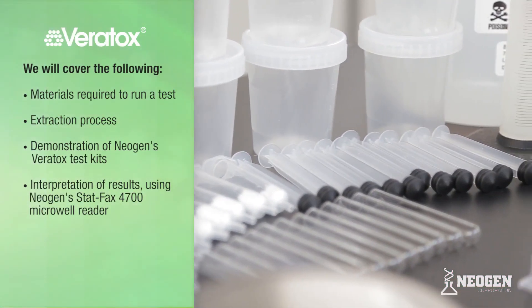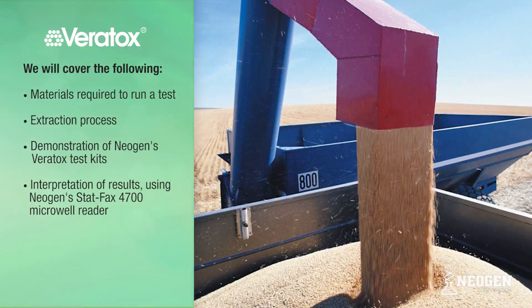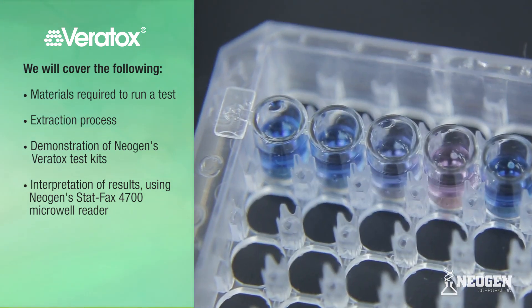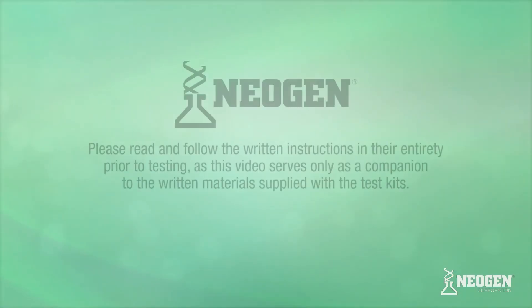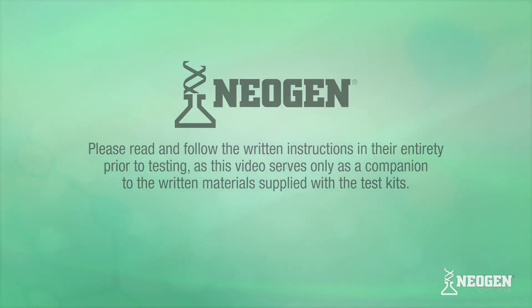We will cover the following: the materials required to run a test, the extraction process, a demonstration of Neogen's Veritox Aflatoxin test kit, and an interpretation of results with Neogen's StatFax 4700 Microwell Reader. Please read and follow the written instructions in their entirety prior to testing, as this video serves only as a companion to the written materials supplied with the test kits.